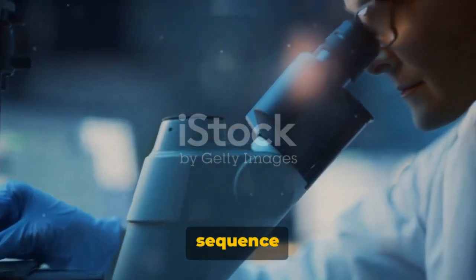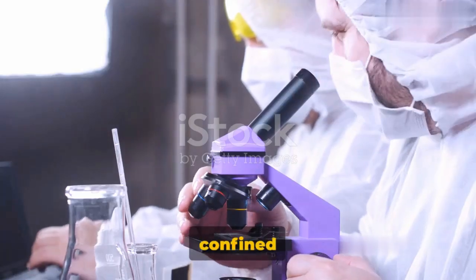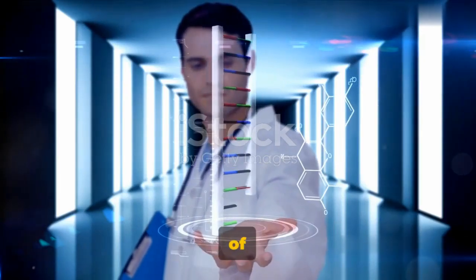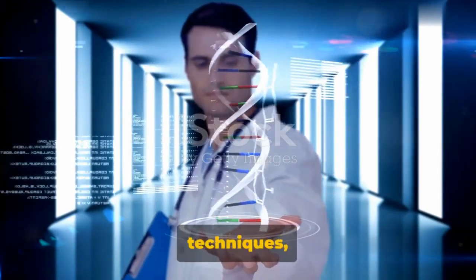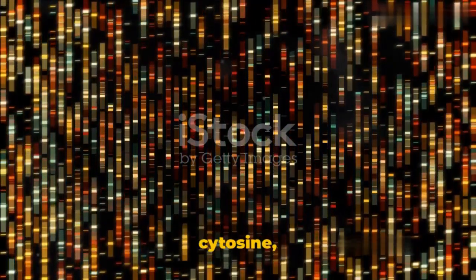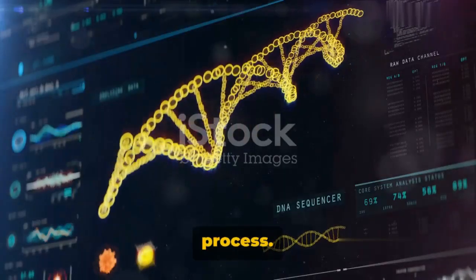The first DNA sequence was obtained through two-dimensional chromatography, a laborious and time-consuming process confined to the academic laboratories of the early 1970s. Fast forward a few years, and the development of dye-based sequencing methods revolutionized the field. These advanced techniques, paired with automated analysis, transformed DNA sequencing into a faster, more accessible process. The once painstaking task of determining the order of the nucleotide bases, adenine, guanine, cytosine, and thymine, in a molecule of DNA became a streamlined, efficient process.